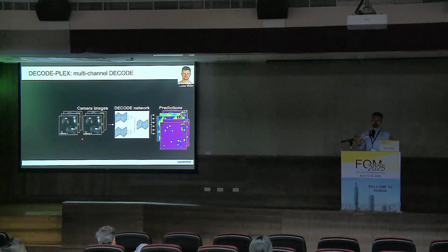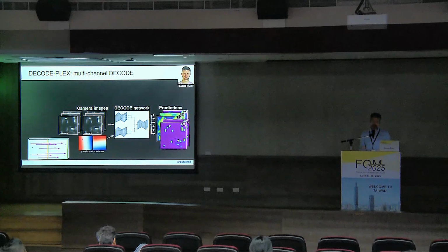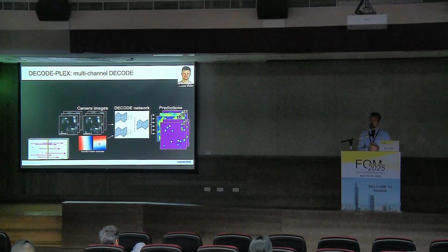Now, it's not easy to register 2 channels on the microscope with single nanometer accuracy. Typically, the channels are related by a transformation that is not trivial, and that has to be calibrated, for example, using multicolor beads on a cover slip. So we do this calibration and inform the network about this transformation by telling it in each pixel how far the channels are apart from each other.